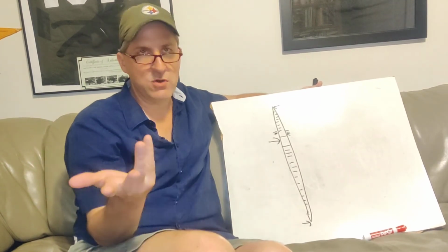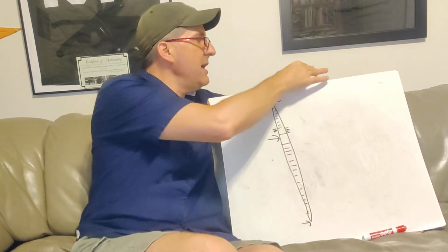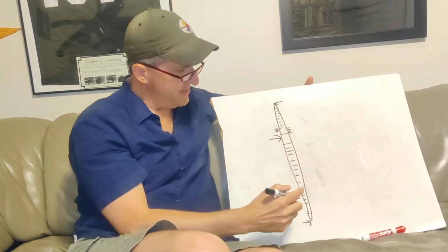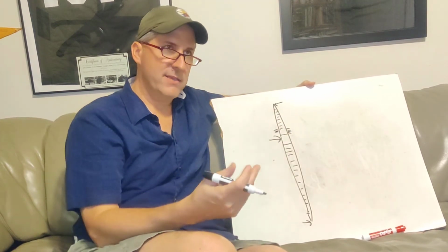Basically, earthworms, I'm sure you know, for a gardener, are a godsend because they help to fertilize and keep the ground broken up as well. Now, but those are the setae. All right, so what you would then do to dissect this thing is you would come from the dark side, not the light side on the bottom.